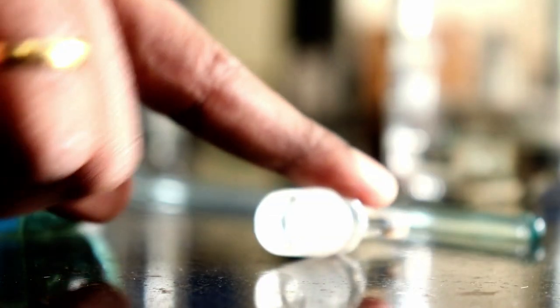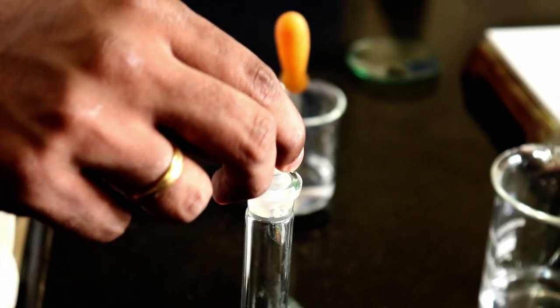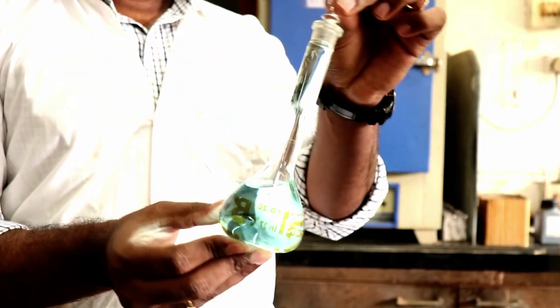Put the stopper on the standard measuring flask and make it upside down two to three times.